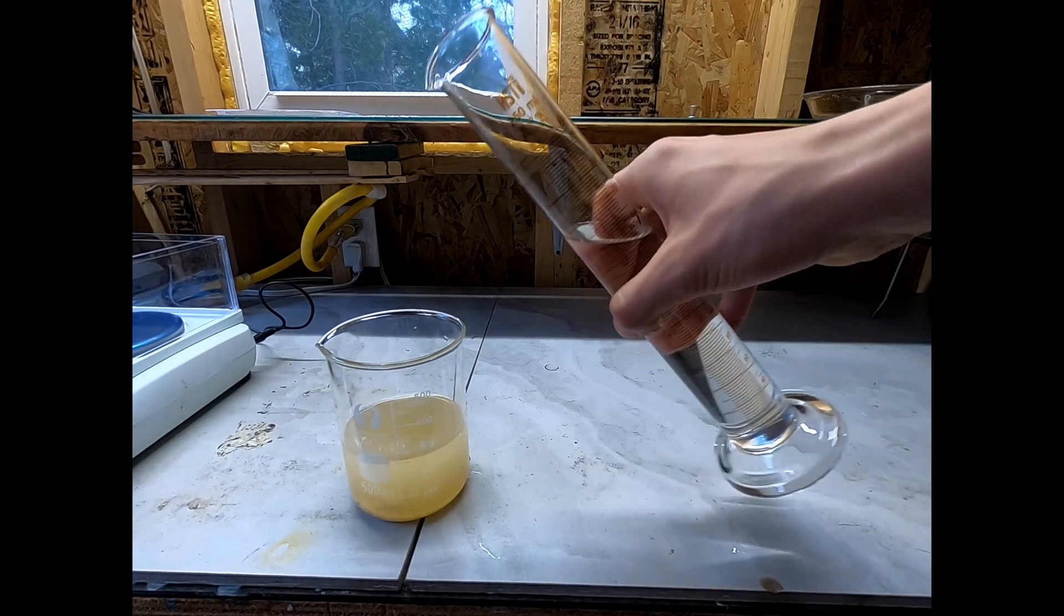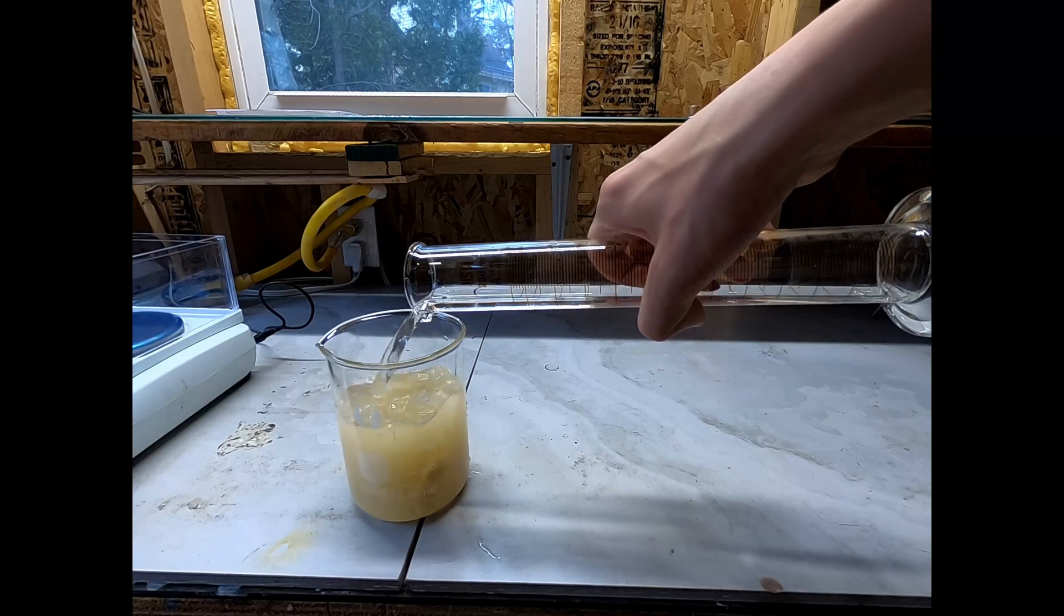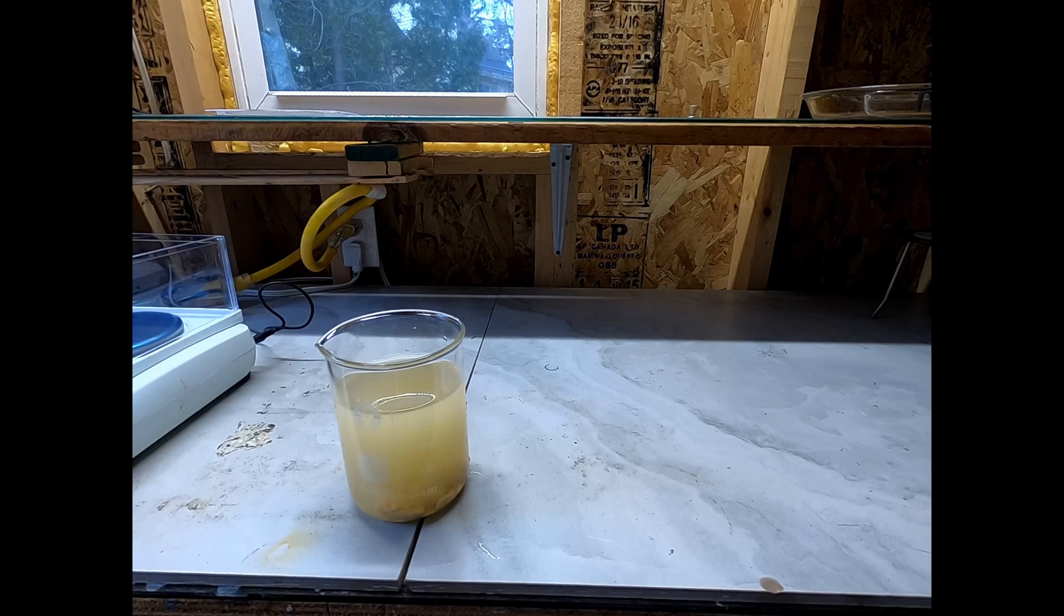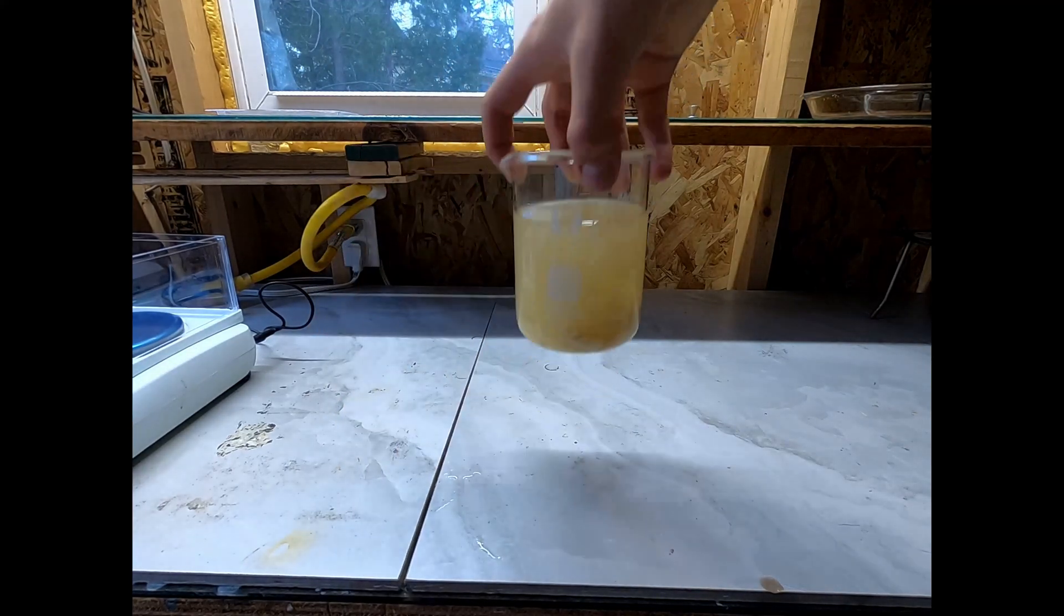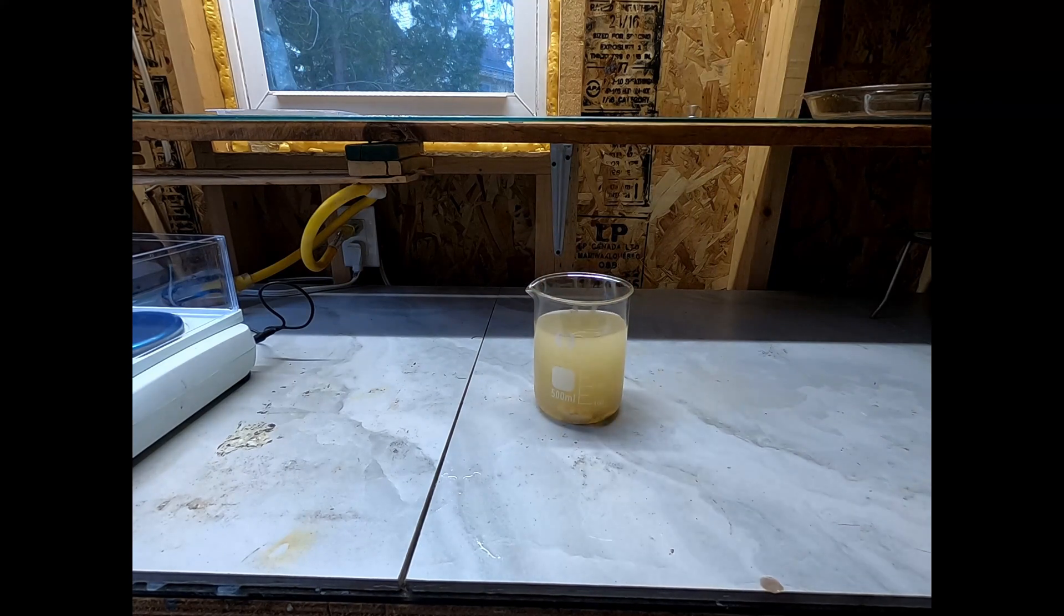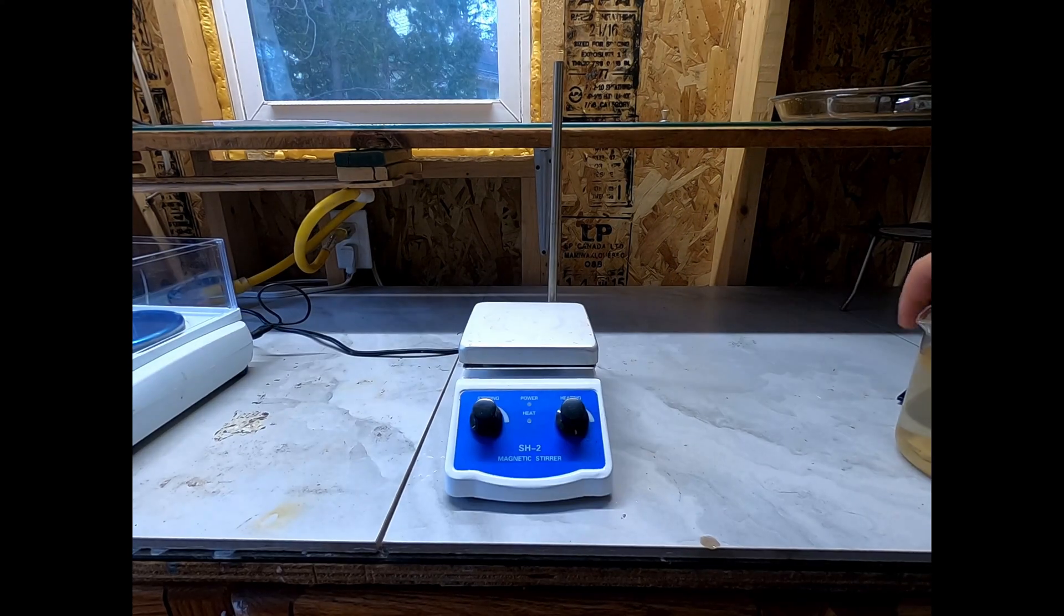As you can see, the sample is very contaminated with a bunch of brown insoluble stuff floating around. Later I'll do a vacuum filtration to separate this, but first I'm setting up a hot plate and stirring to start dissolving most of the solid chunks that should be sodium carbonate.